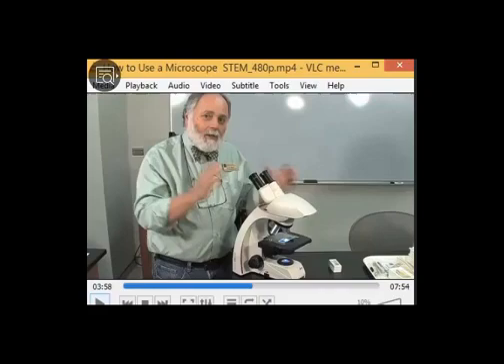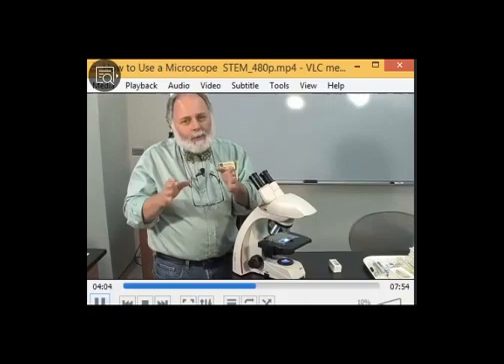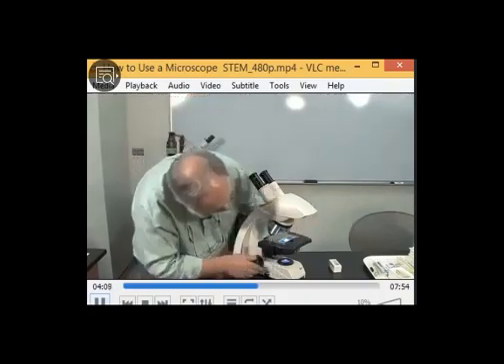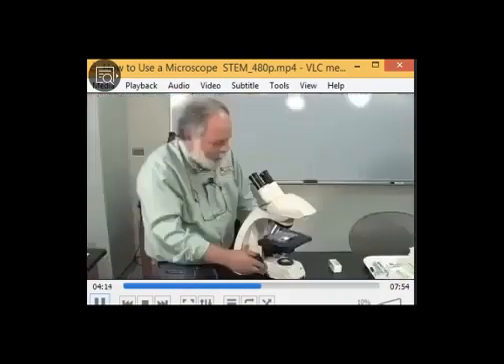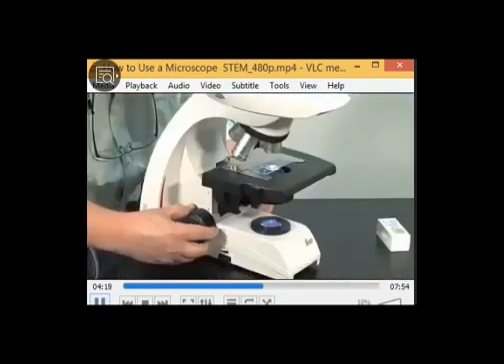Magnification will start from 10x, also called low power, and then 40x, also called medium power, and then 100x, also called high power. So we will just locate the specimen using 4x, and then we will move to 10x. When you move to 10x, see now he is focusing the slide, by moving the coarse focusing knob.